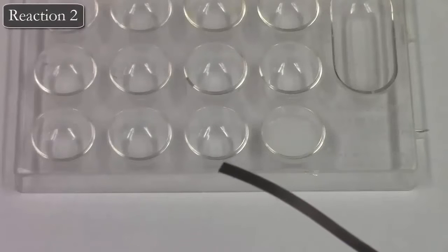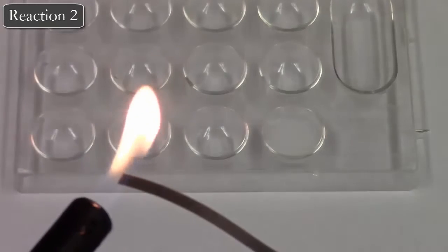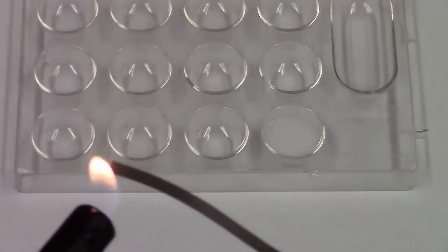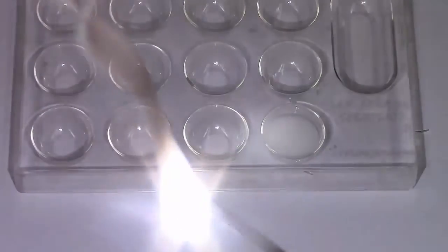Right, in our second reaction, what we're going to do is take a solid piece of magnesium ribbon, and we're going to light it on fire. All right, so once it's lit, observe what happens.